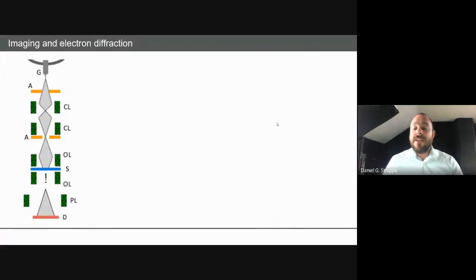So remember, we want to make a shadow of the sample against our camera. And then the magic happens here where there is the exclamation mark, and it's a bit more complicated to put on this diagram. So let's zoom in to see what happens after the electrons get through the sample. So these are the two diagrams on the main imaging modes that we have for generating images, that's the left, and the diffraction patterns on the right. So I'll try to cut the complexity here.